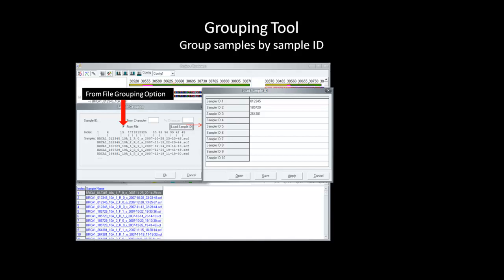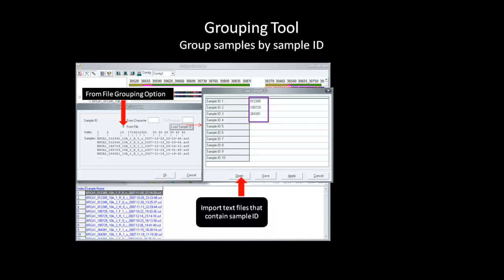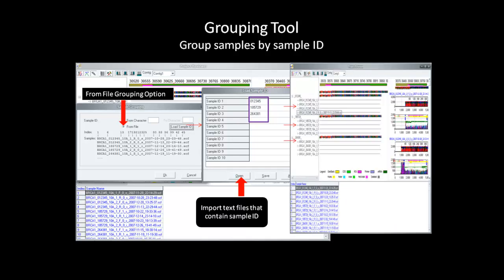Here, you can either choose to manually type in an identifier to group the samples by, or import a text file that already contains the sample ID. When using the importing option, you can specify more than the allotted 10 sample IDs in the dialog box. Here, the grouping of the samples is the same as I inputted the same sample ID that was found between characters 6 to 13.